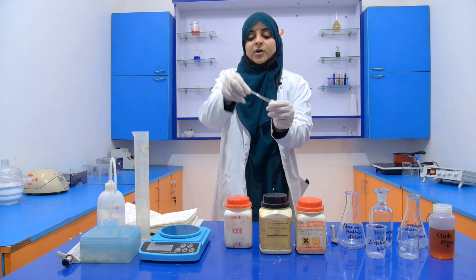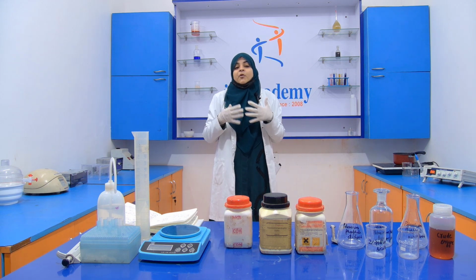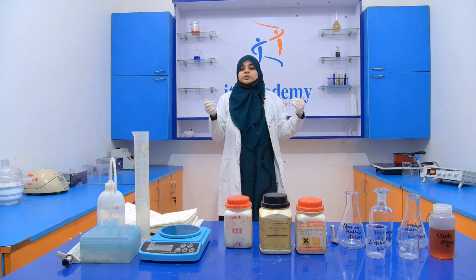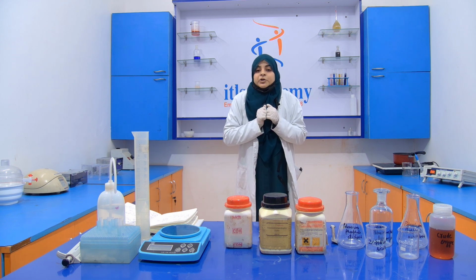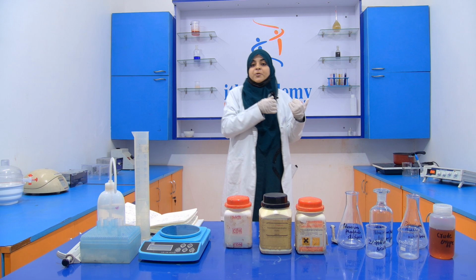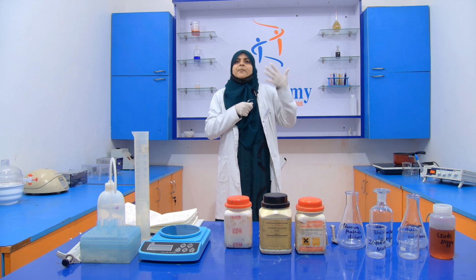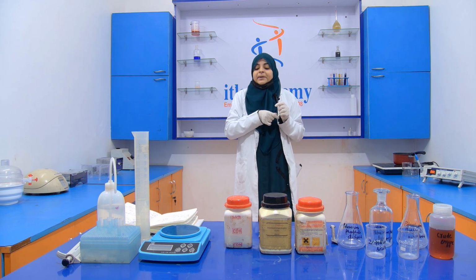You can see that this is a dialysis membrane. So basically, what does dialysis mean? Simply, dialysis is the separation of the larger molecules from the smaller molecules. And these smaller molecules are simply impurities and salt which are present in the mixture of the crude enzyme or the salt precipitated enzyme. That is our sample.